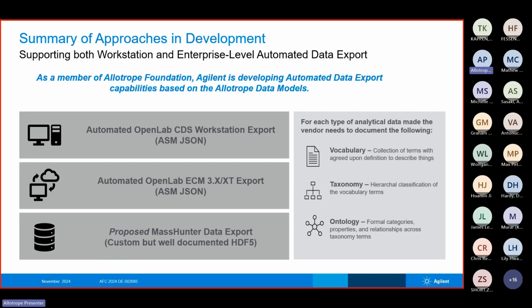So we have three approaches in development for exporting ASM/ADF out of our instruments. The first is the OpenLab CDS export. And the second is we export the ASM files from our content management system. Finally, we are looking into exporting the high-end mass spec data into an ADF-like format. Still playing around with it, but we'll let you know when we make great progress. But I'm interested to speak with somebody who has worked with high-end mass spec data, because there's a lot of data that is generated when we look at it at a raw data level and a processed data level. So looking forward to connecting with you.